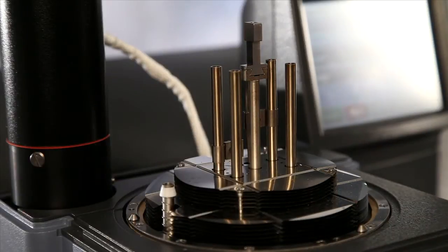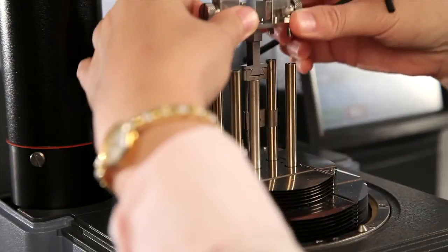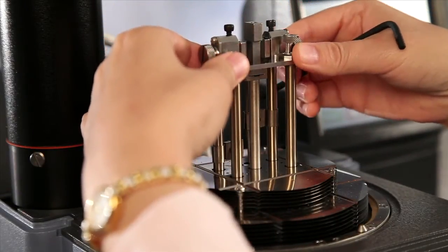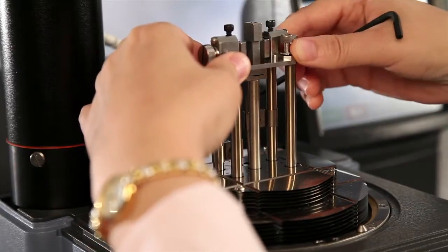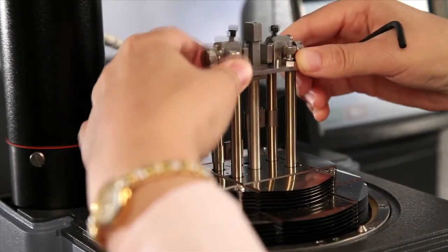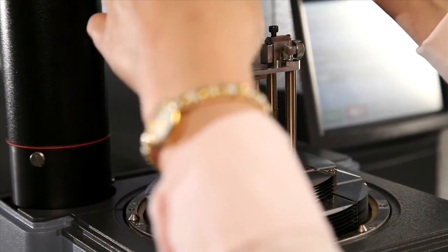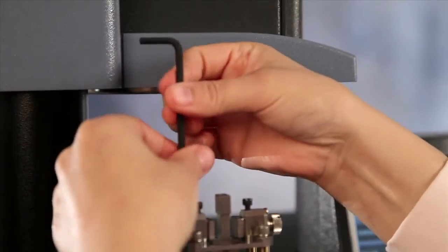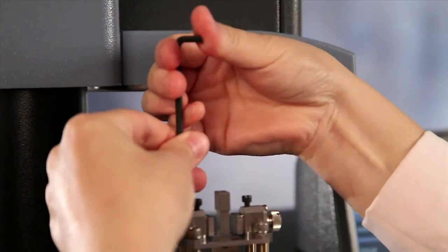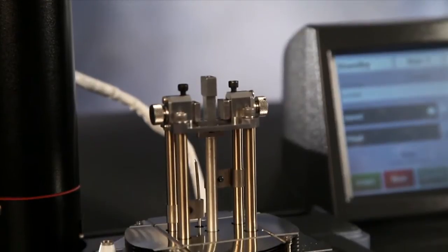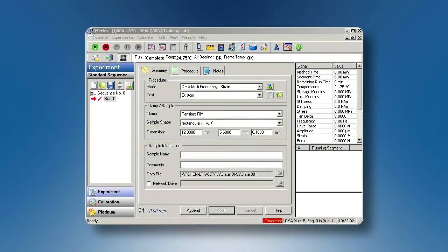Then, install the stationary clamp. Use the Allen key that is provided in the clamp kit and try not to bend the thermocouple.